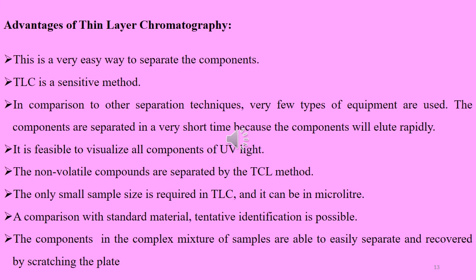Advantages of thin layer chromatography. Thin layer chromatography makes it very easy to separate the components of a mixture. It is a sensitive method. In comparison to other separation techniques, very few types of equipment are used in TLC. The components are separated in a very short time because the components elute rapidly. It is feasible to visualize all components under UV light.